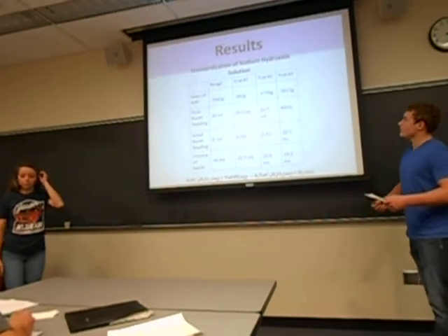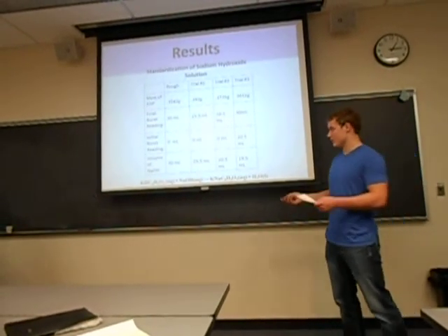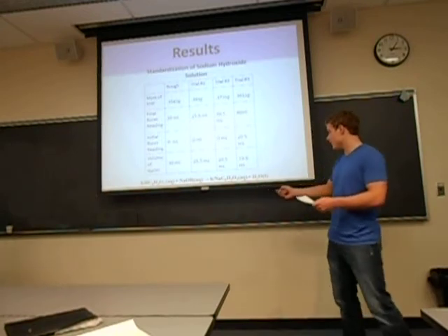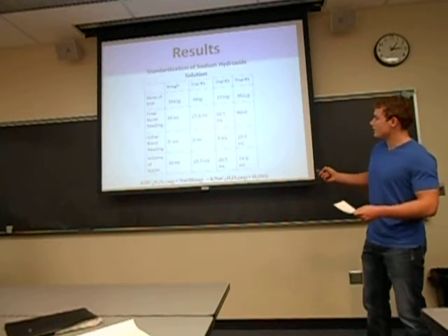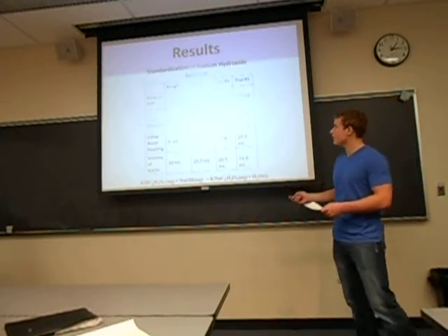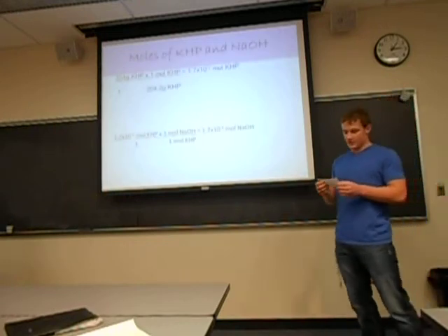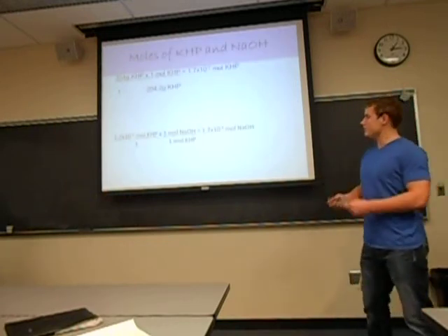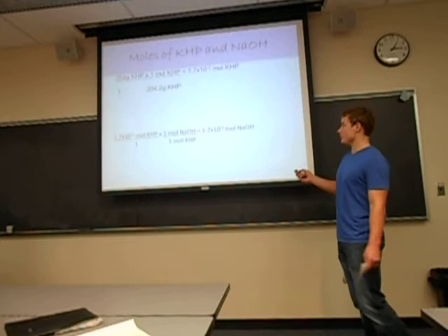Here are the results from our first titration of the sodium hydroxide solution. We have our data at the bottom and all of our numbers from our titration. These are the steps for calculating the molarity of the standardized base solution. This is our sample calculation for trial number 2, by the way.